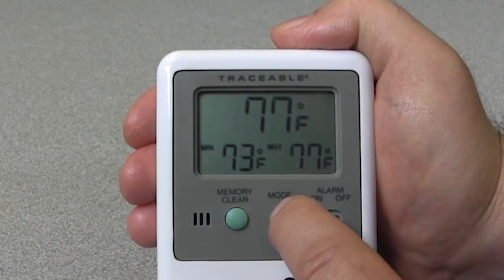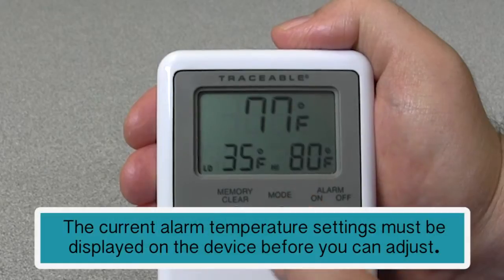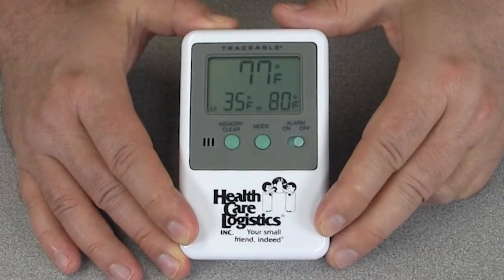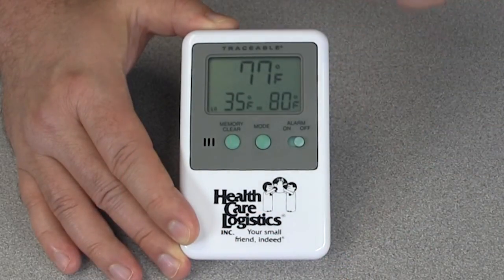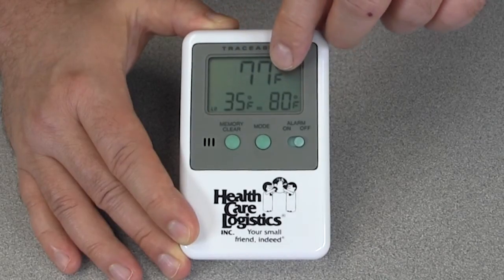When you press the mode button you can alternate between the high-low temperature marks and the alarm settings. Before we can adjust the alarm, the settings must be on the display. Now we can see that the existing alarm settings are set for 35 degrees Fahrenheit for a low and 80 degrees Fahrenheit for the high.